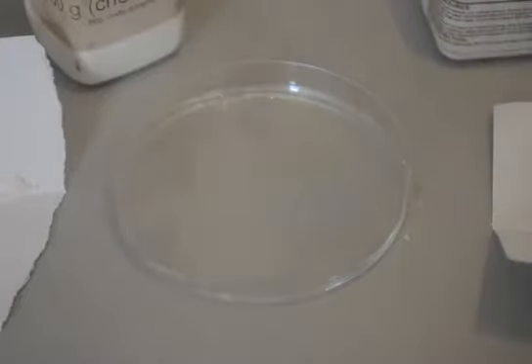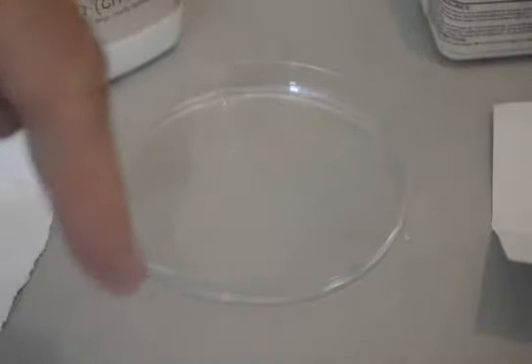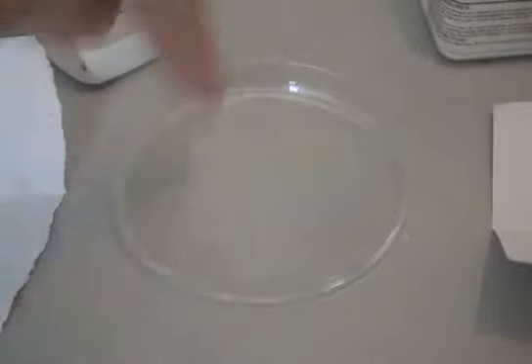What we're now going to do is the same reaction. We've got the same two chemicals, lead nitrate and potassium iodide, and I put a certain amount of the crystals into the paper there on each side. And we've got a petri dish here that's got water in it, deionized water, and we're going to put the crystals on each side, and we're going to wait for them to dissolve into the water and see how they diffuse across, and we'll see a reaction, that yellow precipitate occurring hopefully in a line across the water.